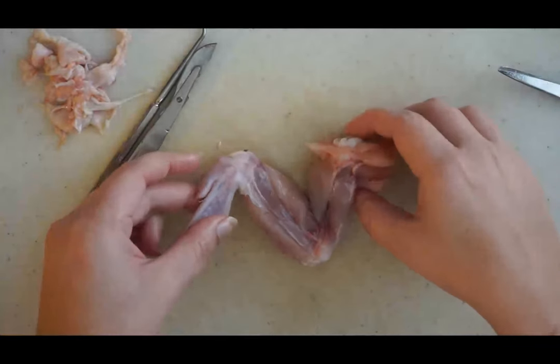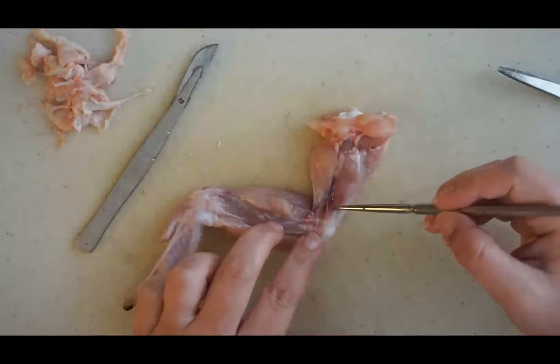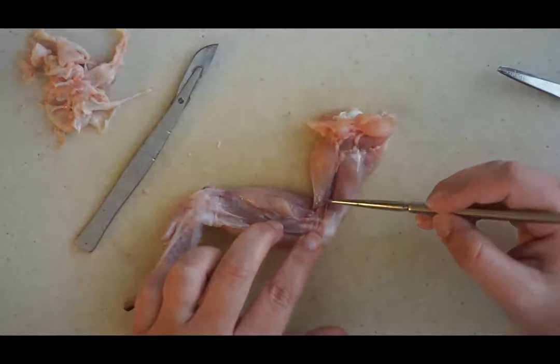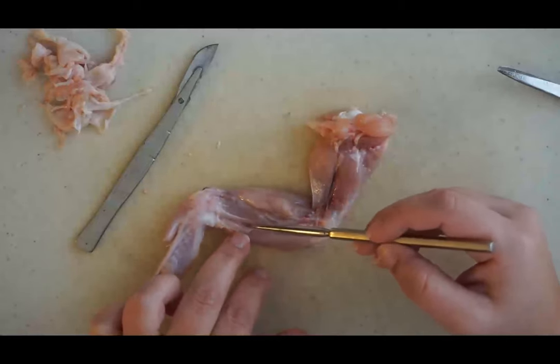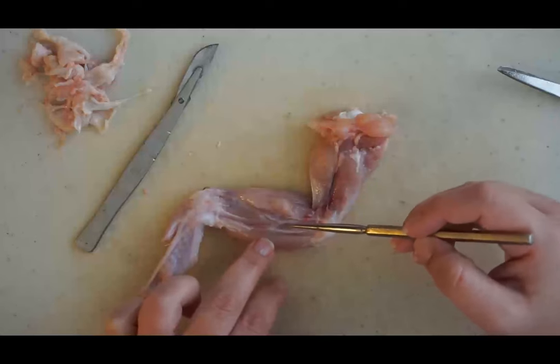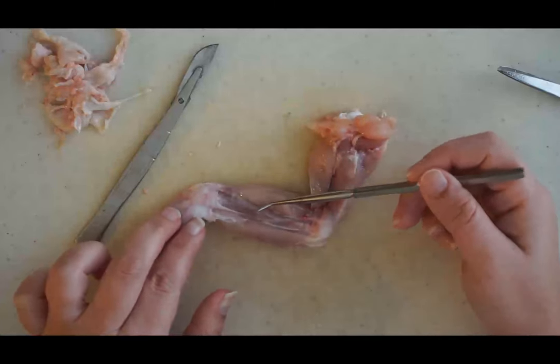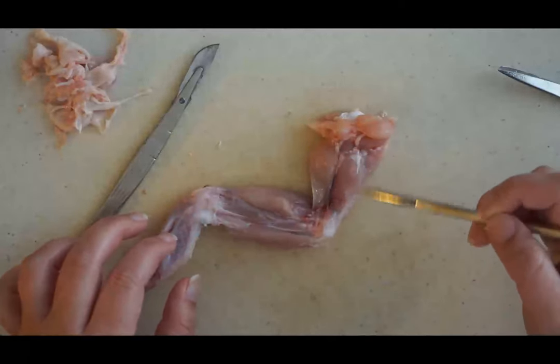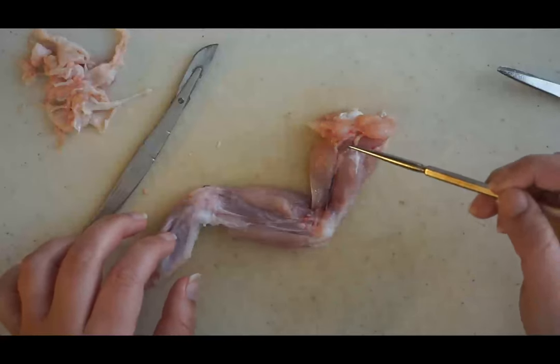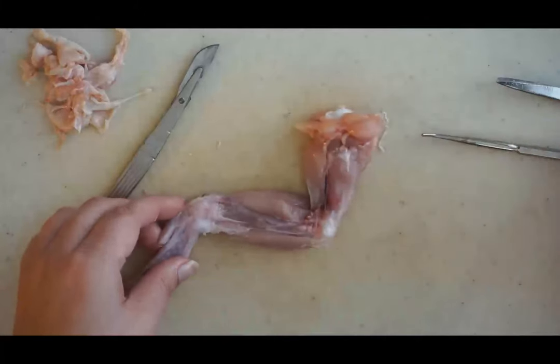Now you can see all the muscles of my chicken wing. Before we start talking about the muscles, take a look at some blood vessels that you can actually see here — those blood vessels supply blood to the muscles. We've got the biceps and triceps and then the shoulder muscles up here, though some of those have been cut.